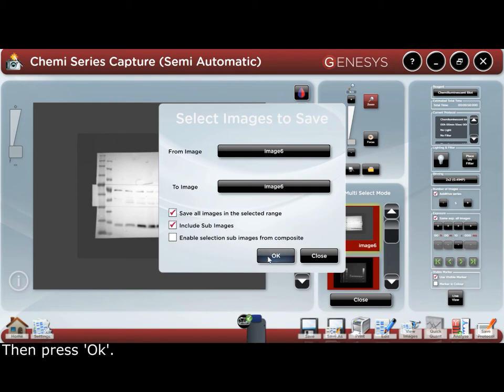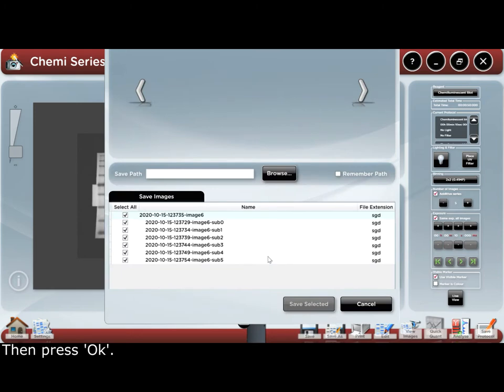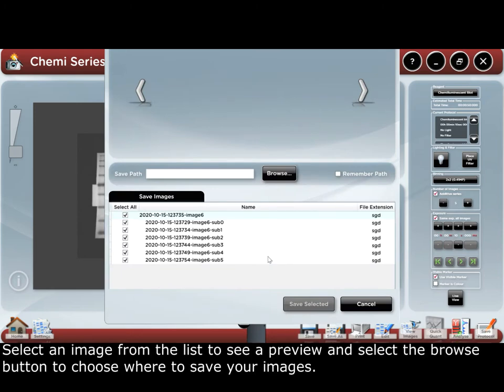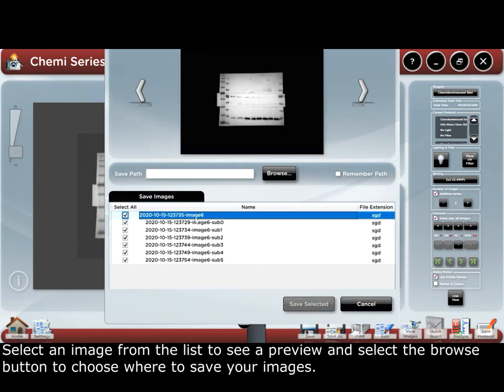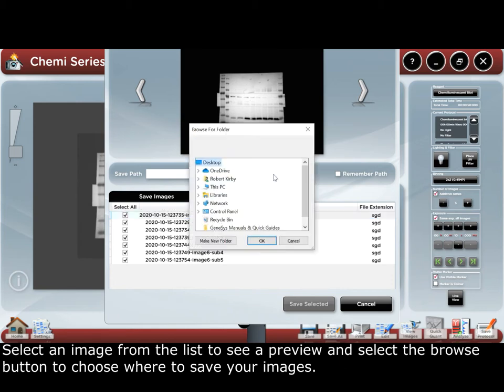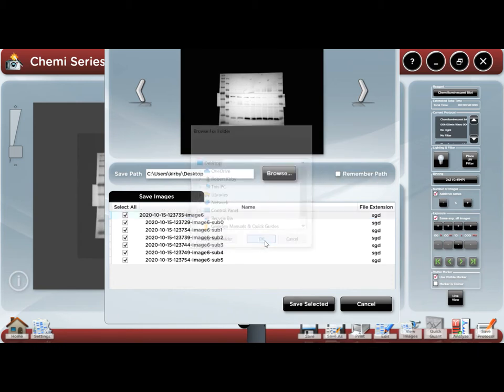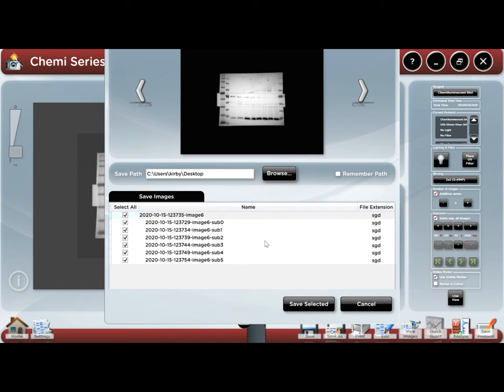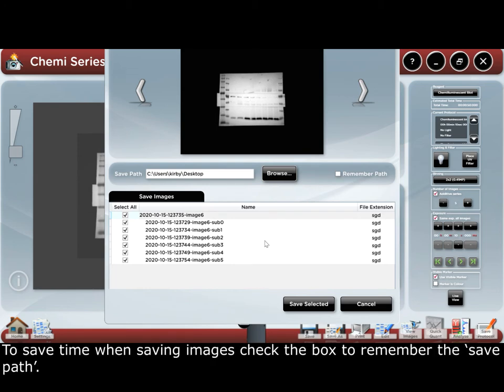Then press OK. Select an image from the list to see a preview, and select the browse button to choose where to save your images. To save time when saving images, check the box to remember the save path.